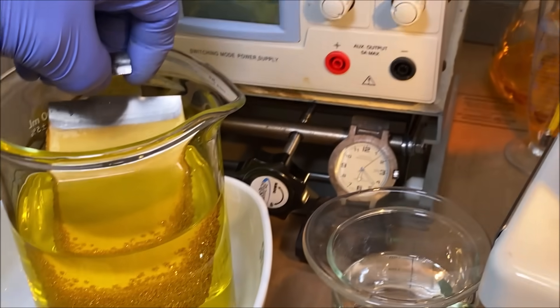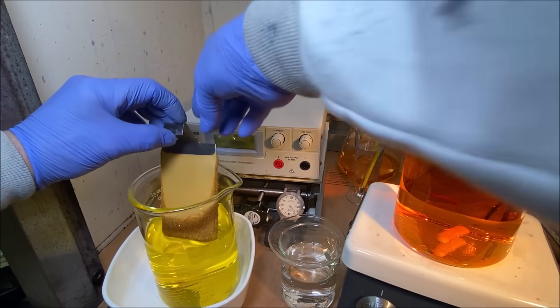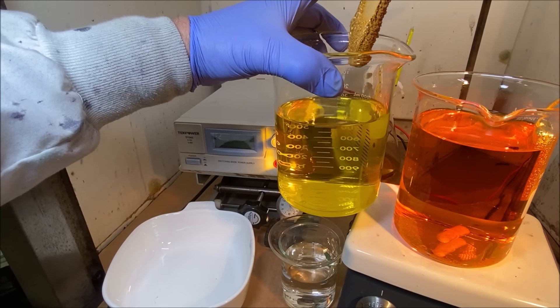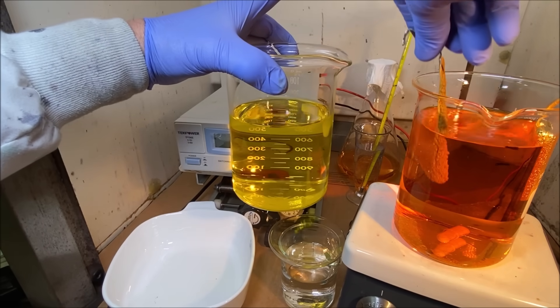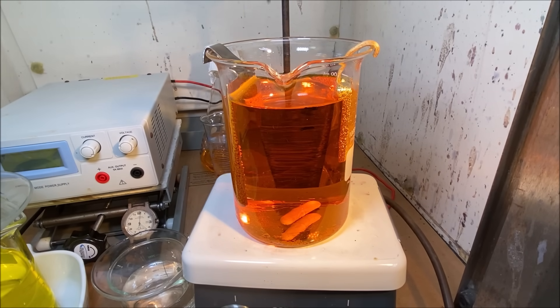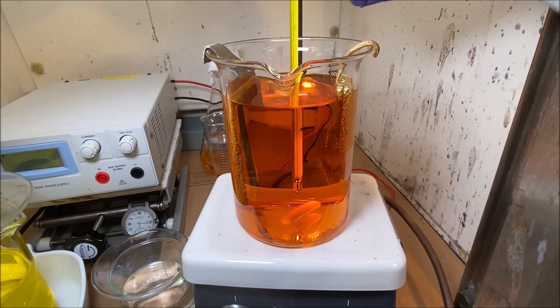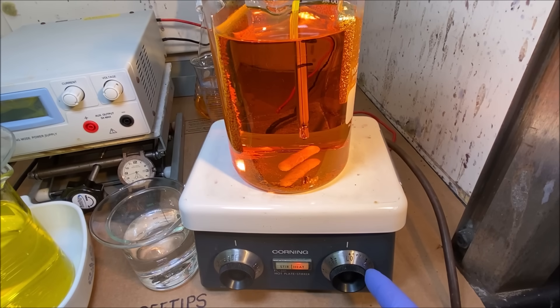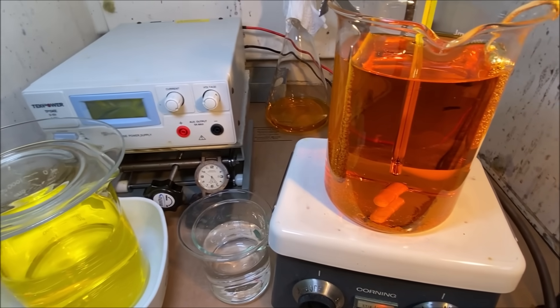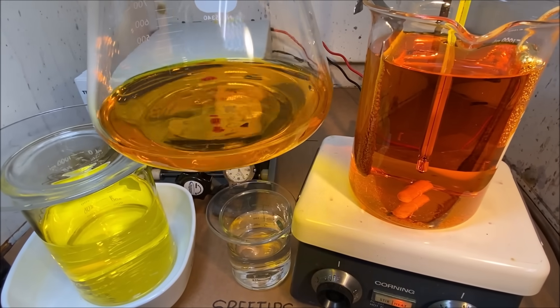Now let's see if we can get this thing situated and get it back in the cell. This is just distilled water that I had it soaking in. Let's get our thermometer back in here — got the heat on low, heating our electrolyte up. Let's get this stuff out of the way — this is our spare electrolyte that we can use to replenish the cell as it operates.